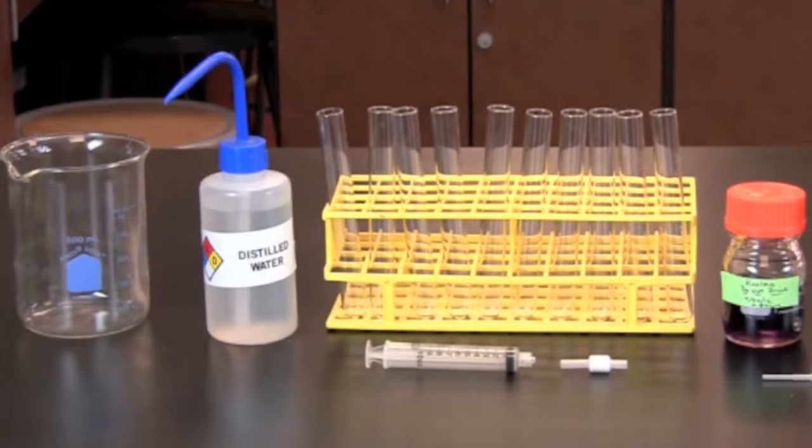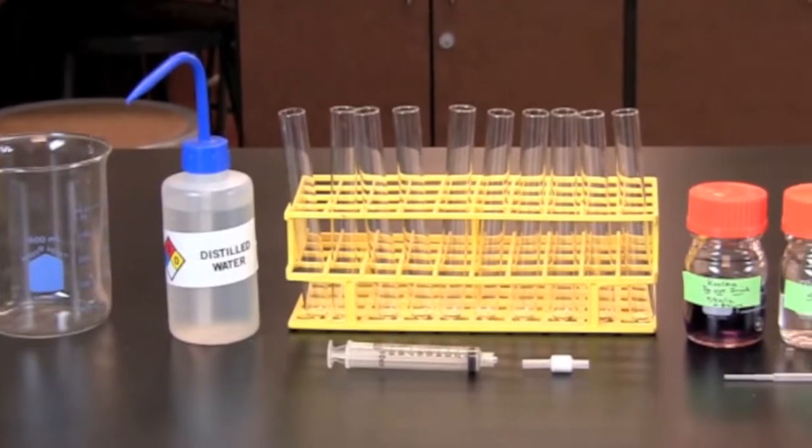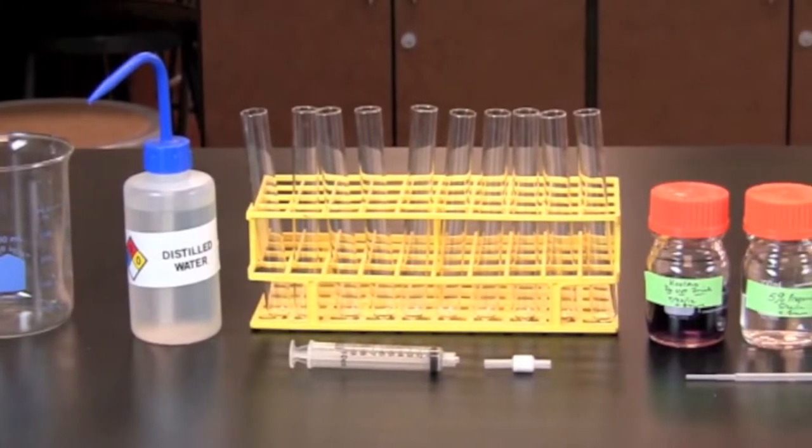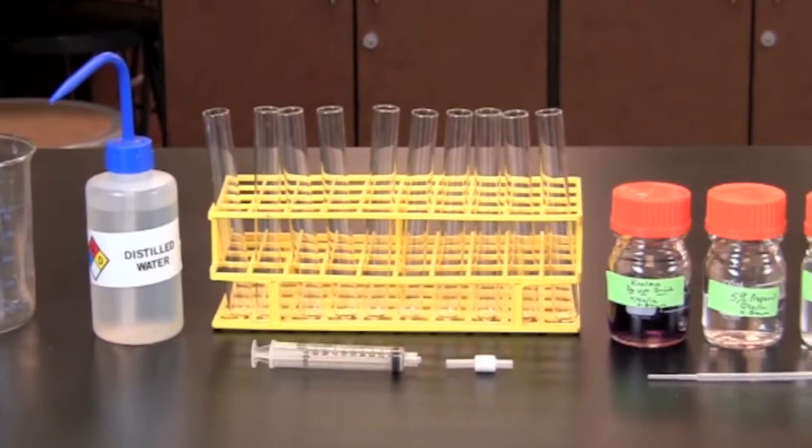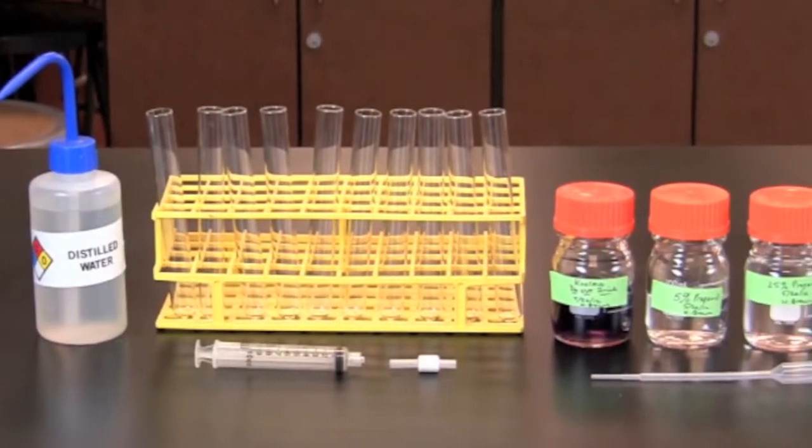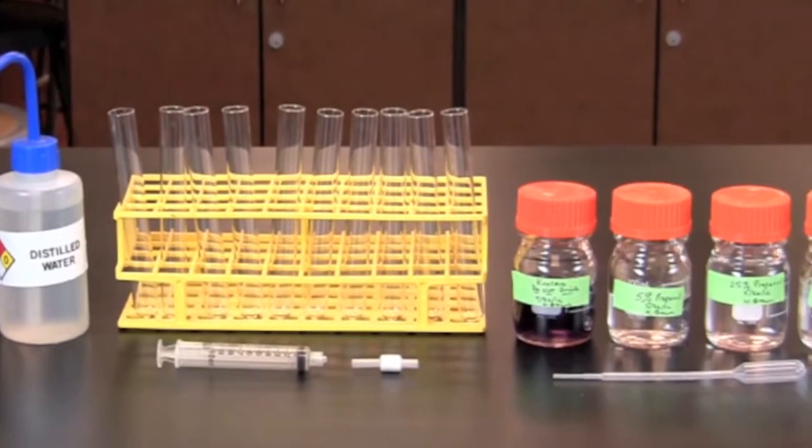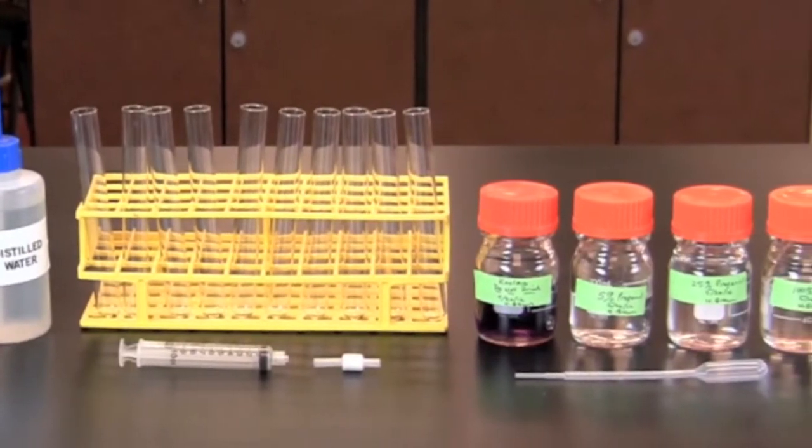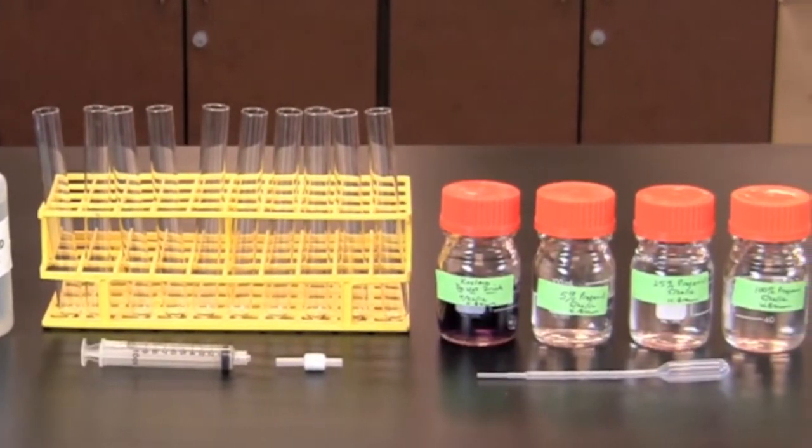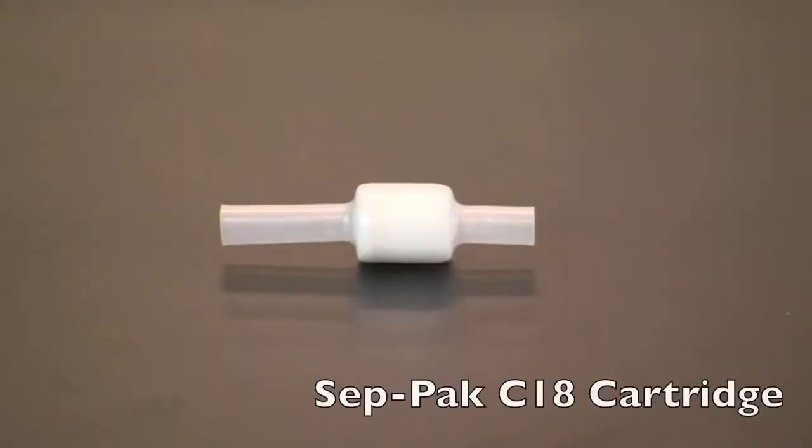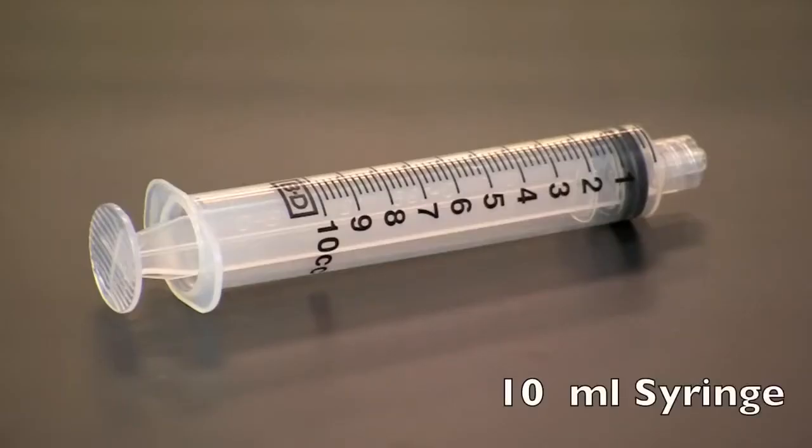Prior to starting this lab, you will need to obtain a beaker for waste, a squirt bottle with distilled water, 10 clean test tubes, a mixture of Kool-Aid, 5% and 25% 2-propanol solutions and concentrated 2-propanol. You will also need a CEPPAC C18 cartridge and a 10 ml syringe.